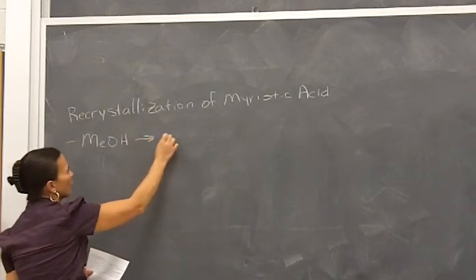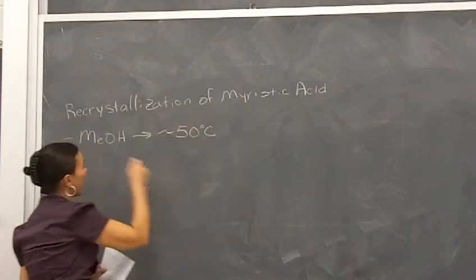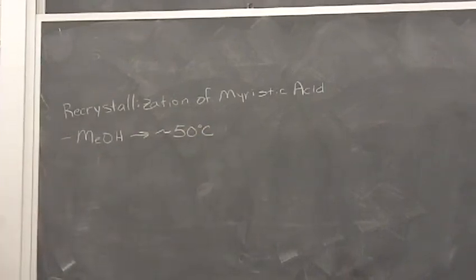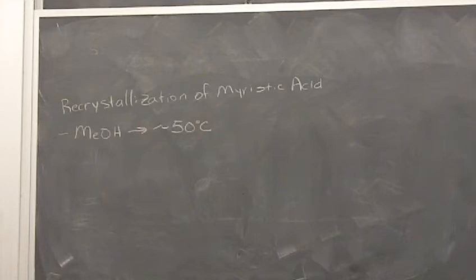And the thing is, we only want this at about 50 degrees Celsius, okay? So we're not heating our methanol to boiling. We're just heating it to about 50 degrees Celsius. And the reason for that is our solids melt at really low temperatures. So if you get the solvent too hot, then you're going to melt your solid instead of actually recrystallize it. And so you get this oil in your mixture instead of actually dissolving the solid, okay?